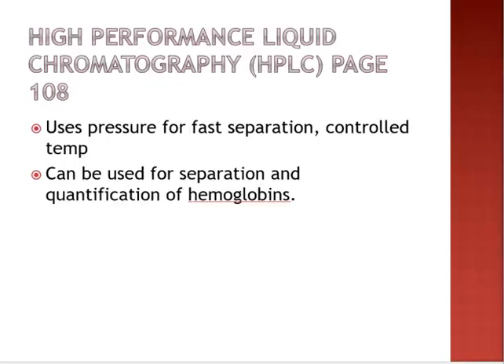The last type of chromatography that we're going to talk about is high-performance liquid chromatography. It uses pressure for fast separation, and it's controlled by temperature. It can be used for separation and quantification of hemoglobins.